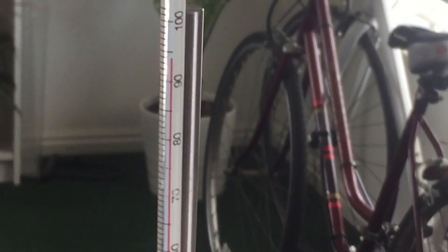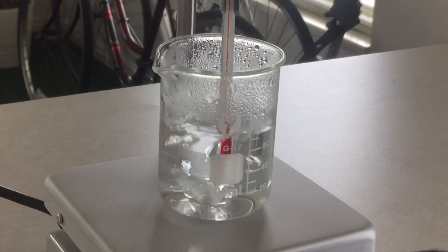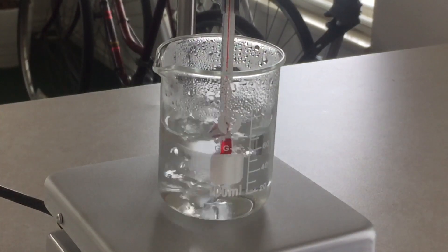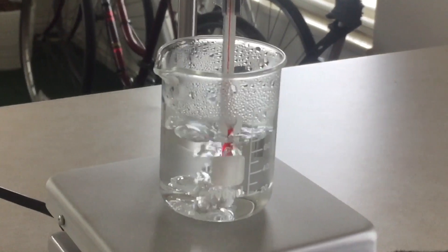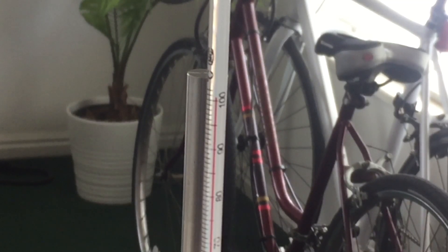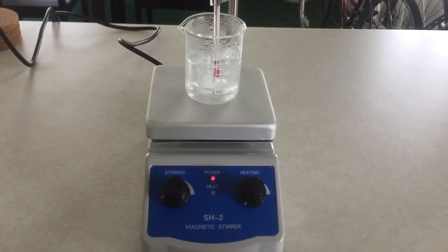We were almost at boiling — you could see the water vapor coming off. There was also some smoke coming from the back of the actual hotplate, so I had to crack some windows because it was putting off some fumes. It was so faint I couldn't see anything melting or on fire. I'll probably email them about that. After about 5 or 10 minutes it stopped — maybe it was just some grease smoking off. Here we're at 100 degrees Celsius and the water's boiling. I just turned off the heat and turned the stirrer down low so it keeps circulating. It'll work for what I need it to.